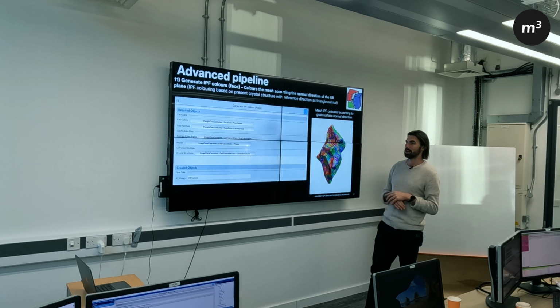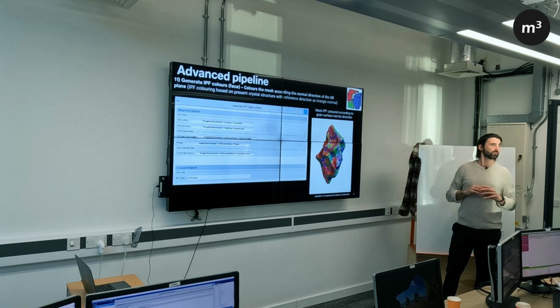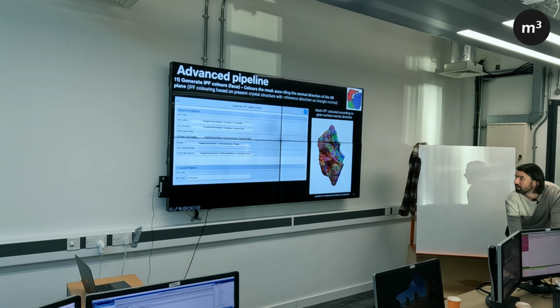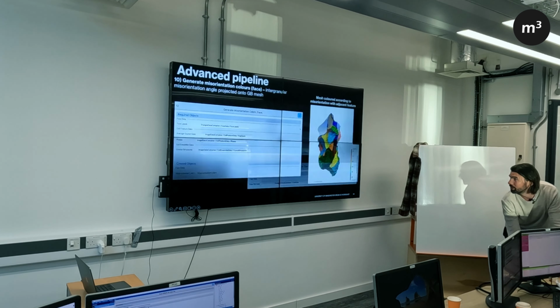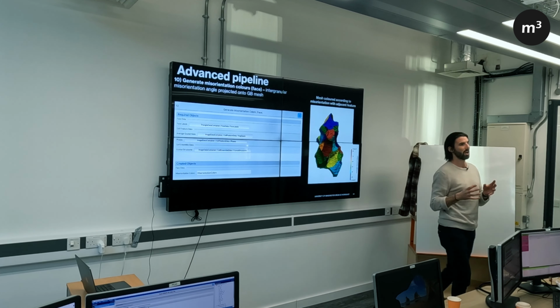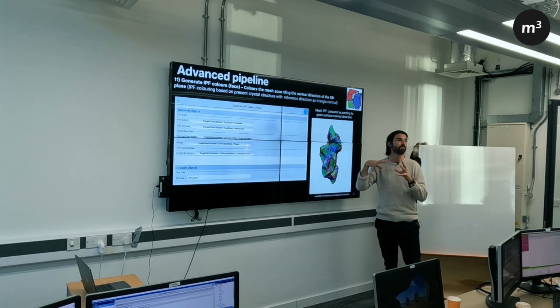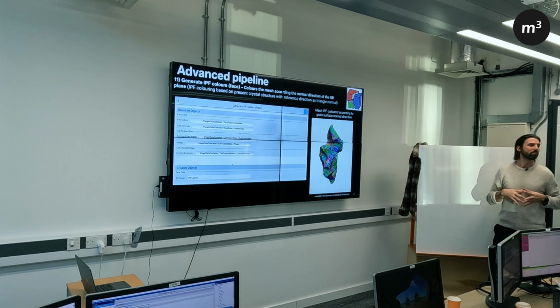So you can see these regular structures. But yeah, this is just an example of, at the start when I said, you got this really nice recrystallized microstructure, and even at this stage you start to think, let's go back a slide. At this stage you start to think, oh yeah, I've got an idea of what's going on here. Each one of these is a particular grain boundary misorientation. Yeah, okay, I can kind of deal with that. And then you go another stage and you realize how much that grain boundary plane is changing even on a single misorientation angle axis pair. This is when you start to realize that, hold on, grain boundaries are pretty crazy.